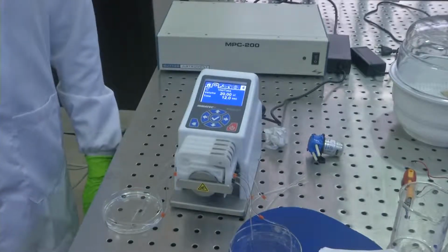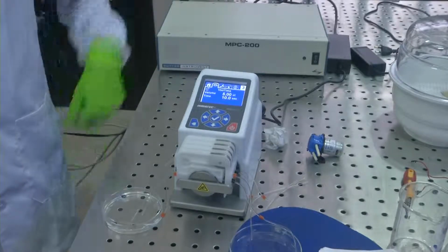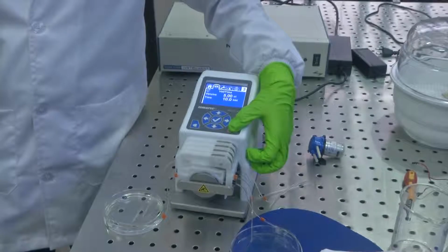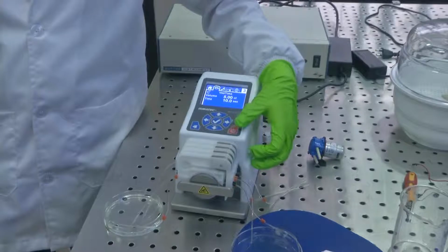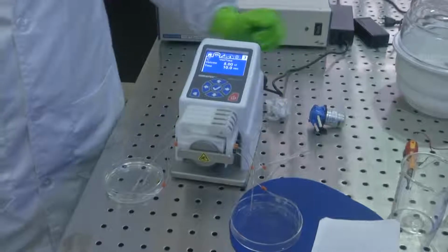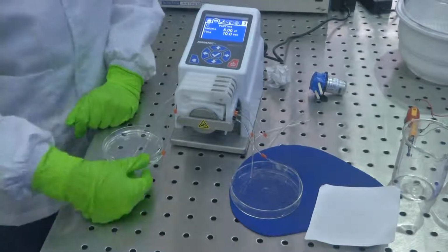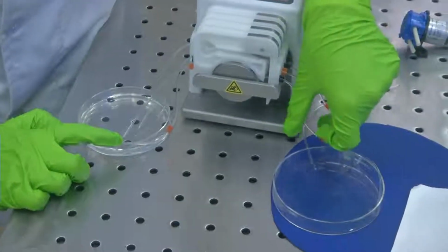Change the channel to 3, okay. Start. Let's see, now we are in cassette 3, clockwise direction, and the volume is set at 5 microliter, which will flow for 10 seconds. 5 microliter of fluid flows for 10 seconds. So, we observe where is the source, and then we have the sink. So, we have taken some DI water, and let us see, in 10 seconds 5 microliter of fluid should be flown from the source into the sink in the clockwise direction.